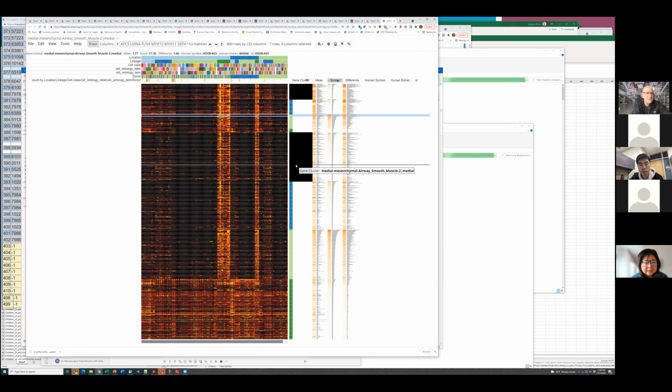And you probably did some comparison with the original paper, like for example, the severity markers, and show the association of the prediction. Yeah, that's very straightforward. Usually we do way better than what's in the paper. Oh, okay. Almost always. That's great.